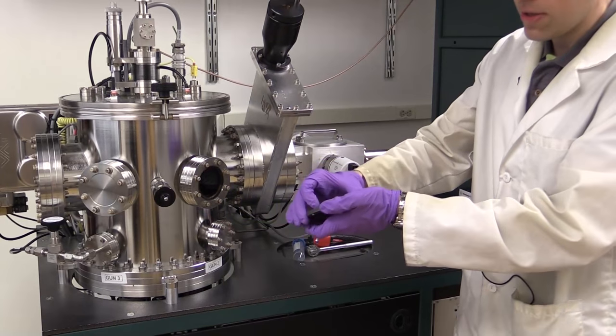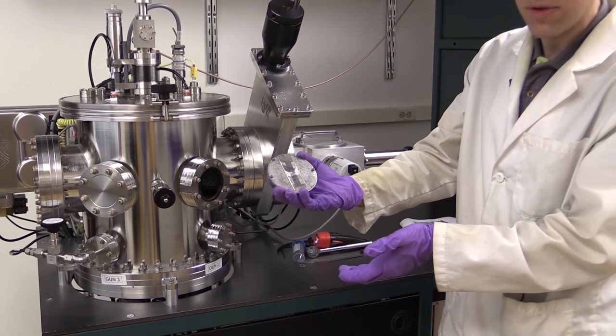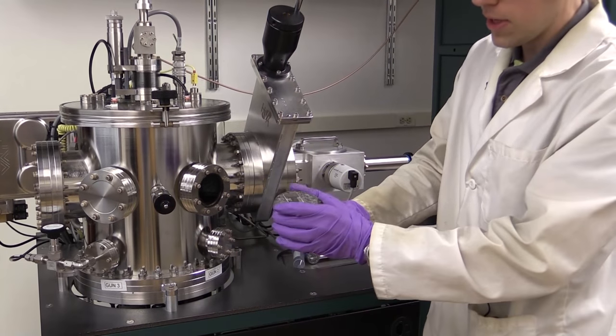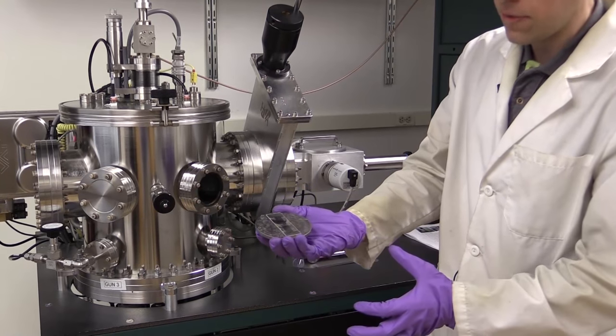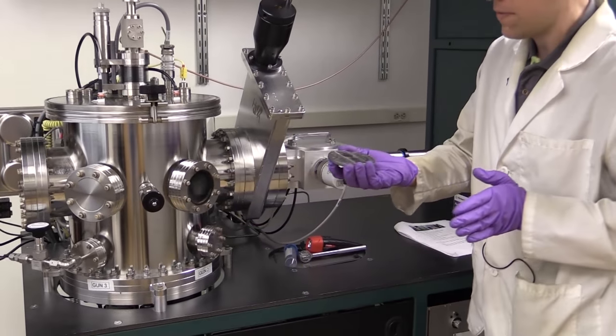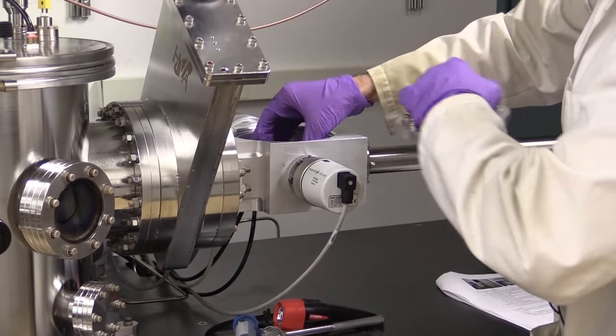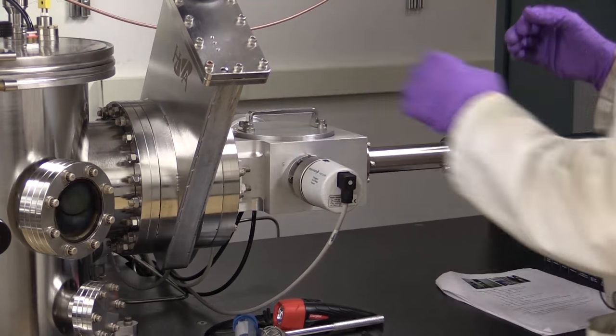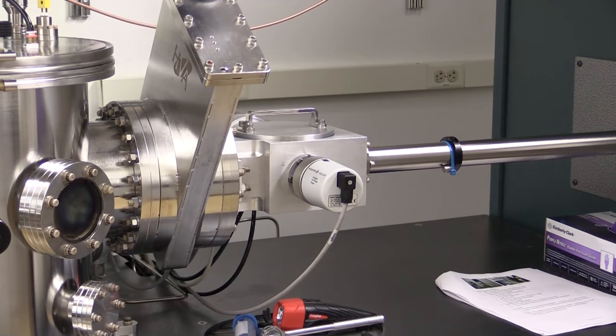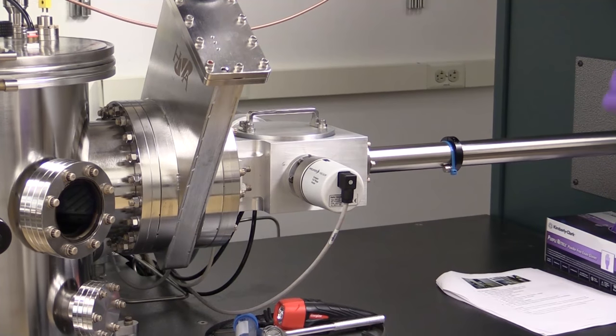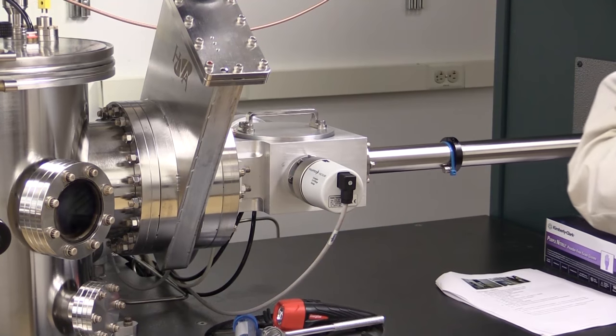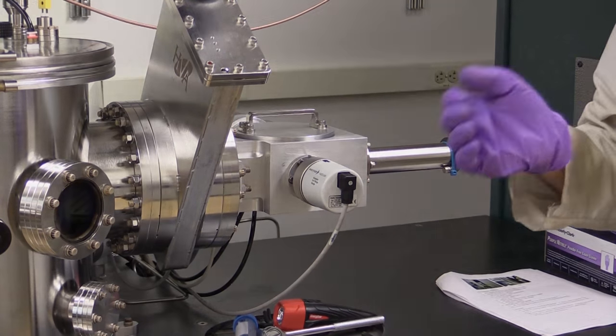At this point, I'll go ahead and load this substrate holder in the load lock chamber. I've got three screws on the front of my substrate holder that will face the gate valve. Now I will activate the load lock pumps. This is going to take about five minutes to get a vacuum, so we can take a short break.